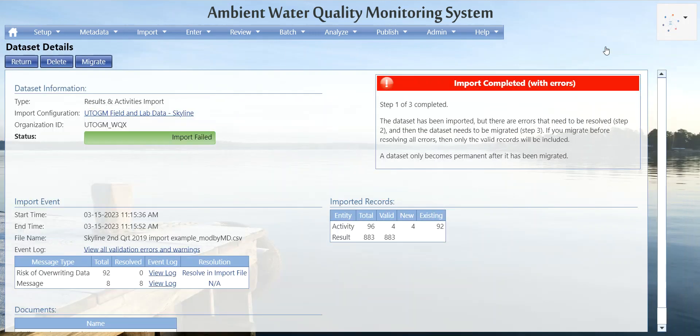We get a message that the import failed. Step one of three: the data set has been imported but there are errors that need to be resolved, and then the data set needs to be migrated. If you migrate before resolving all errors, only the valid records will be included. The data set only becomes permanent after it has been migrated — right now it's just a copy of your file, not yet in Aquums.